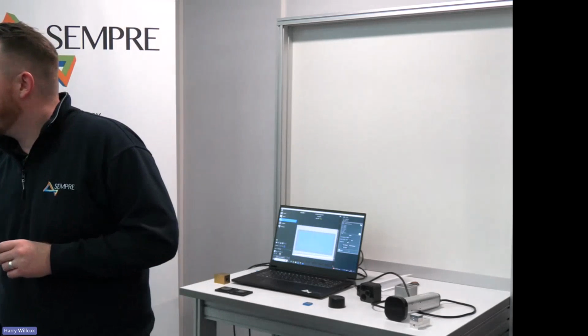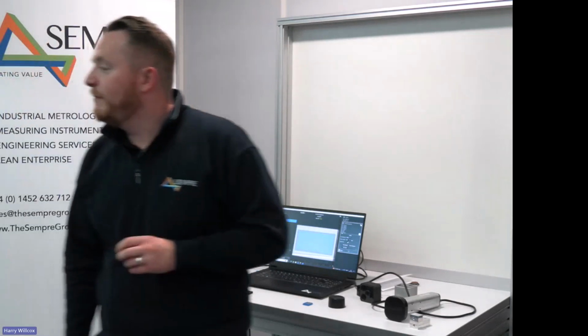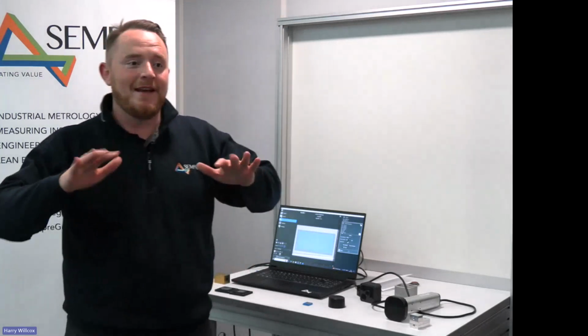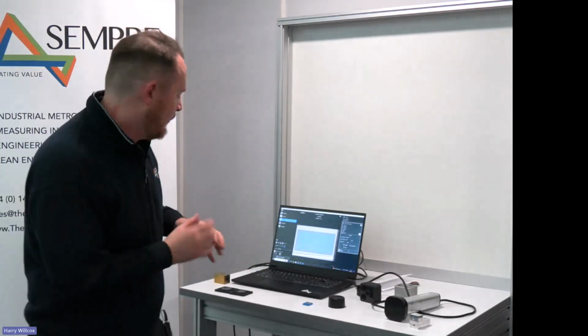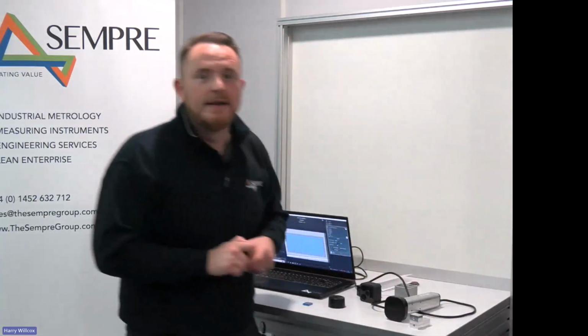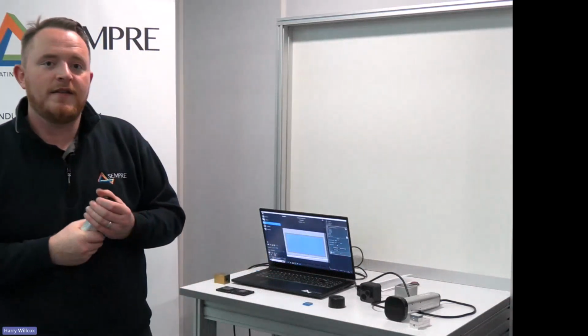Can you give me an idea of system cost and replacement pad costs? Of course. So you might need a pen and paper because it's relatively specific. If we were looking at the Gelsight Series 2 system, you'd be looking at a starting point of around 32,000 for the system.